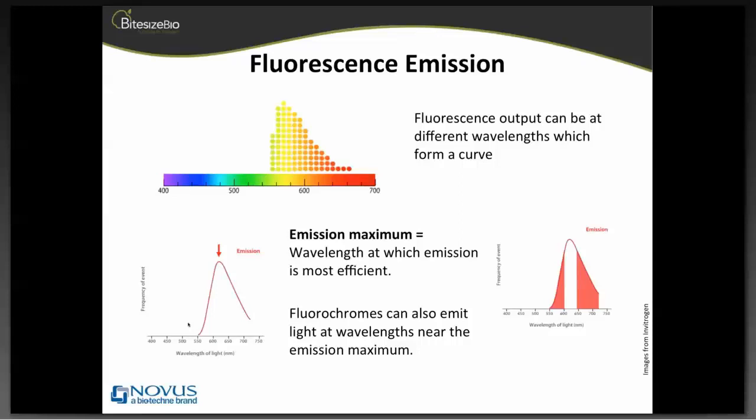There's just a question here about absolute count. Can you tell us maybe why we're not able to do absolute counts on a standard, differential pressure cytometer? So the flow rates that are set on the differential pressure machines aren't exact. They've not really been measured, and though we go from low, medium to high, and they can be read in the manual, you can't say what they actually correspond to. They've not actually been measured, so therefore we don't know if we run a sample, for example, 2 minutes on high, that we're actually running 120 microliters of your cells, because it also needs to take into account aborts going through the machine and things like that.